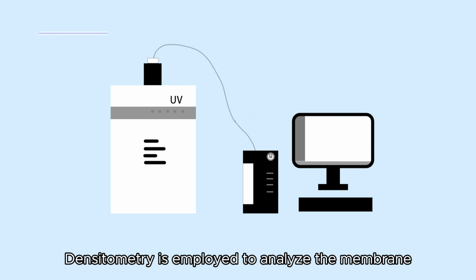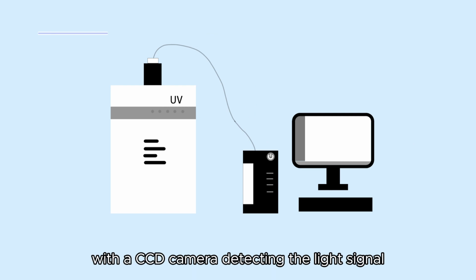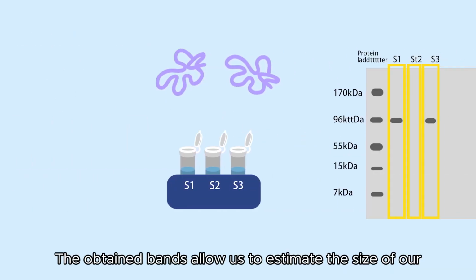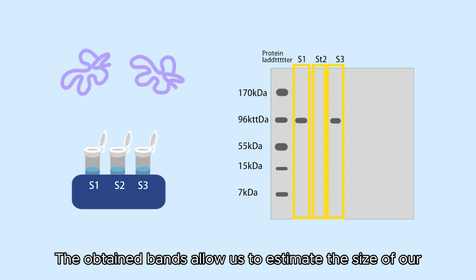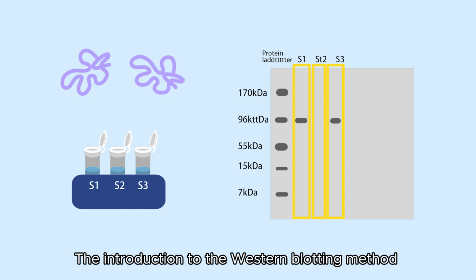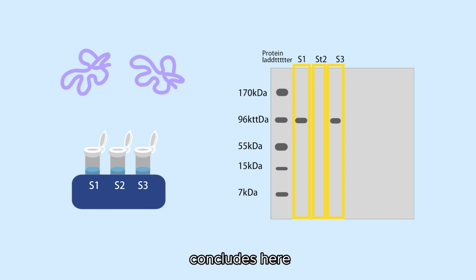Following incubation, the membrane is covered with transparent plastic wrap to prevent drying. Densitometry is employed to analyze the membrane, with a CCD camera detecting the light signal and capturing a digital image of the Western blot. The obtained bands allow us to estimate the size of our target protein and ascertain its presence or absence in each sample. The introduction to the Western blotting method concludes here.